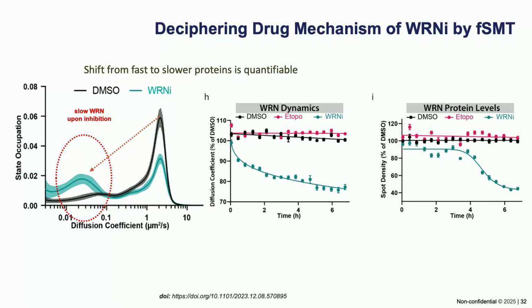But you can see how fast in time this is working, and how this peak is going to grow as a function of time. It's a very, very rapid effect. And if we compare to other techniques characterizing these molecules, we can see that over time we are going to degrade the molecule, but not in the same dynamics as we are changing the diffusion of these particles.